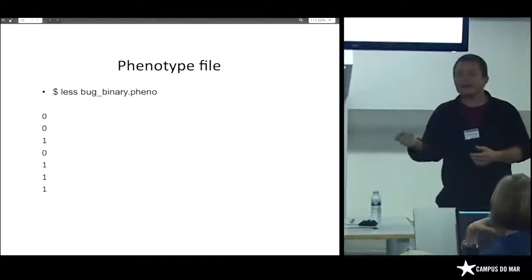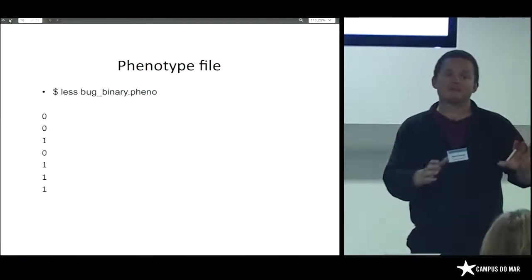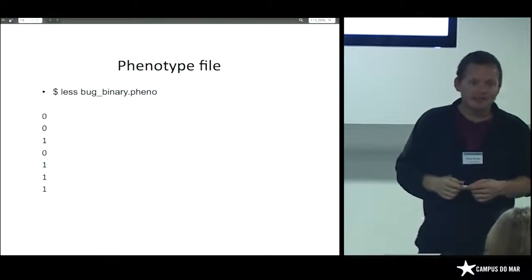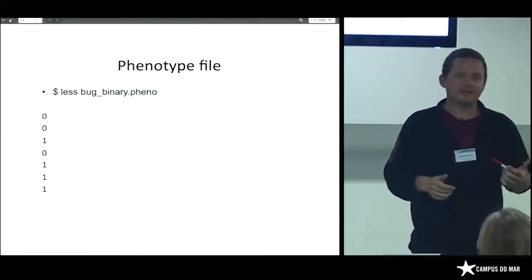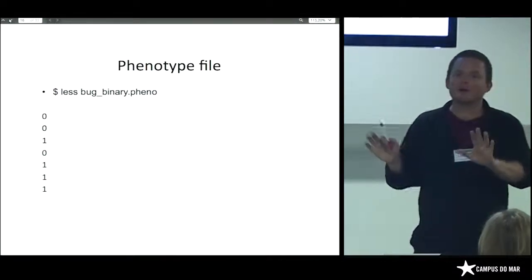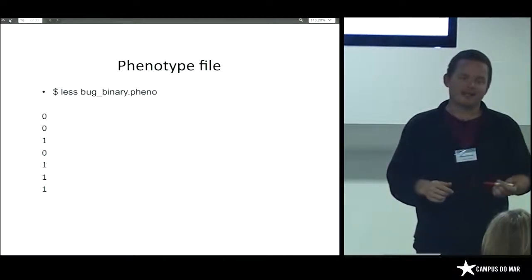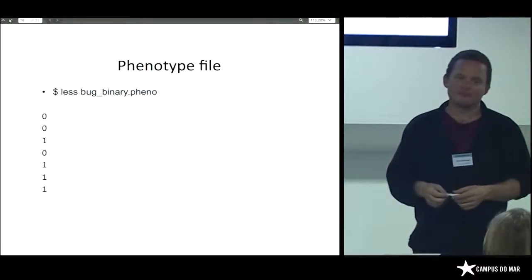Or you can forget the Bayesian approach and do a whole multivariate approach, and you can have a 4-column phenotype file and submit that as the job. And it will be very fast, but because it's not a Bayesian approach, you're going to have a less solid estimate. You're not going to have any hyperparameters, so you're not going to split it into multiple populations. It's going to assume it's a single population of SNPs with an underlying distribution, and that may not be the case because there could be some SNPs that just have absolutely no association, which is why we like the Bayesian approach.